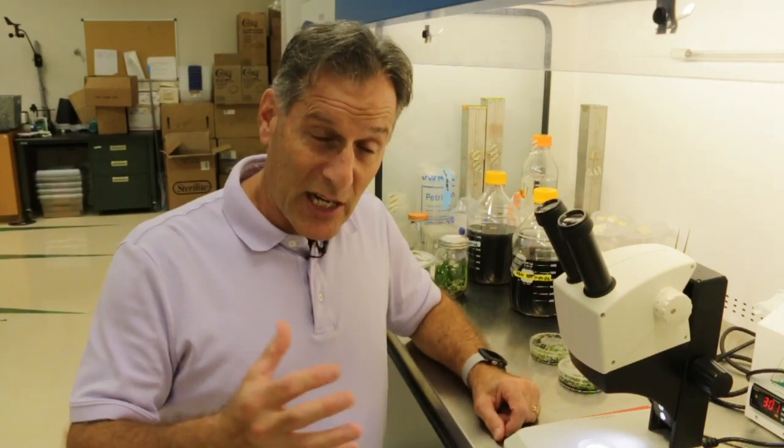And so I was looking through some of the plates, and I saw the albino seedlings that I showed you last time. And then I also looked at some of the other seedlings from that same self or cross that had been transferred onto a medium screen, and I saw, as you might imagine, yet another albino in there.